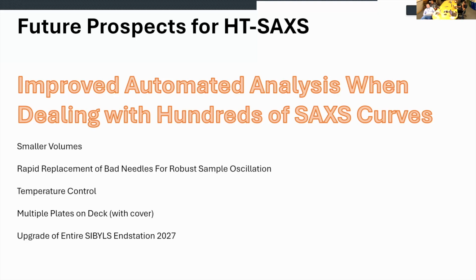But other things that are coming up are the ability to collect from smaller volumes, so 10 microliters instead of 30 microliters. We would like to be able to rapidly replace our needles, so we have a sample oscillation. I'll have a slide on it, but being able to rapidly replace needles would really improve things. Brandon's introduced temperature control so that every time your needle lands with your sample in it, we can modify the temperature.